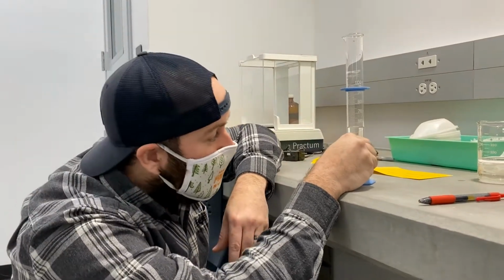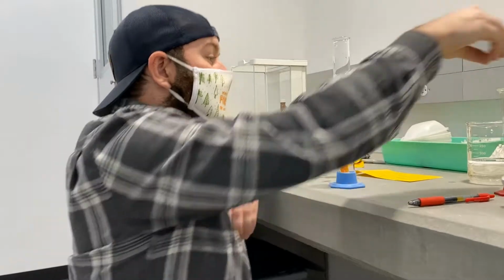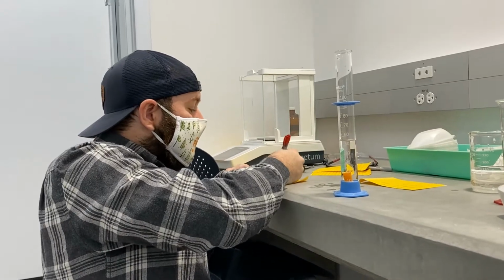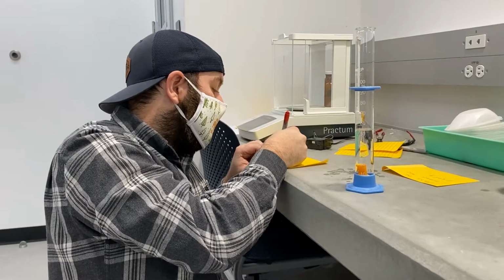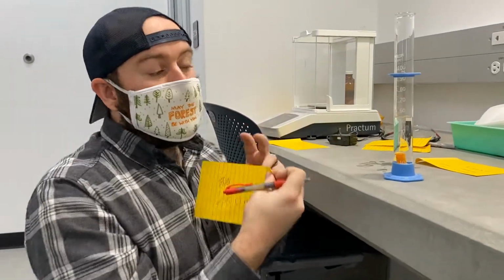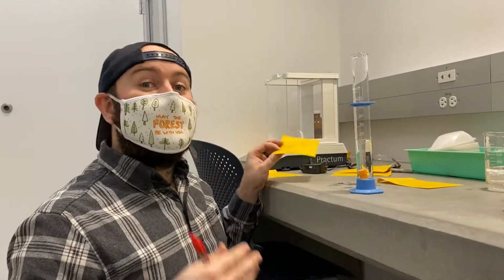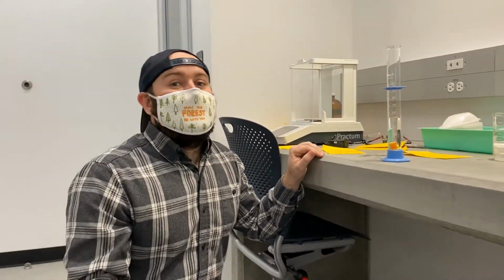So looking at this again, I can now see that my volume on this graduated cylinder is 55.0 milliliters. So the volume is 55.0 milliliters. The difference in these two volumes will give me my volume for the little alien solid. And with that and the mass, we can calculate its density.